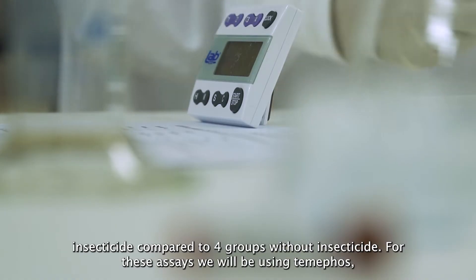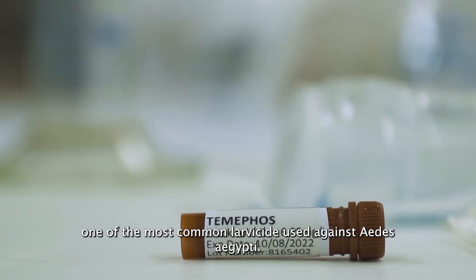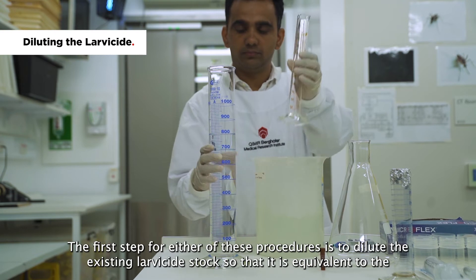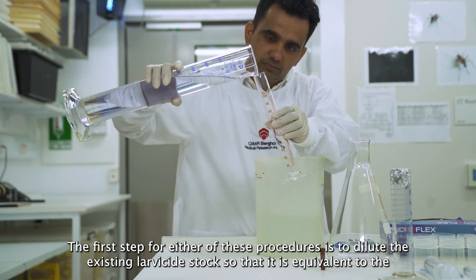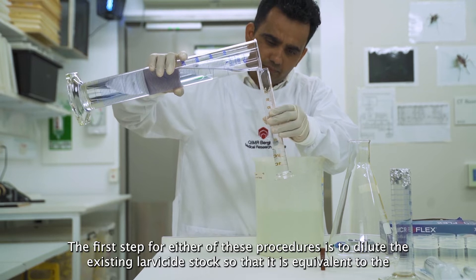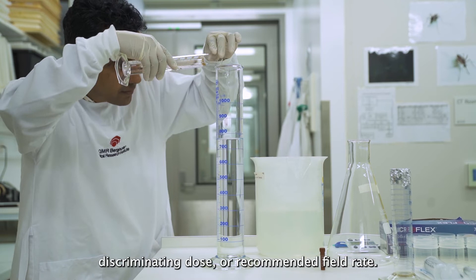For these assays, we will be using Temephos, one of the most common larvicides used against Aedes aegypti. The first step for either of these procedures is to dilute the existing larvicide stock so that it is equivalent to the discriminating dose or recommended field rate.